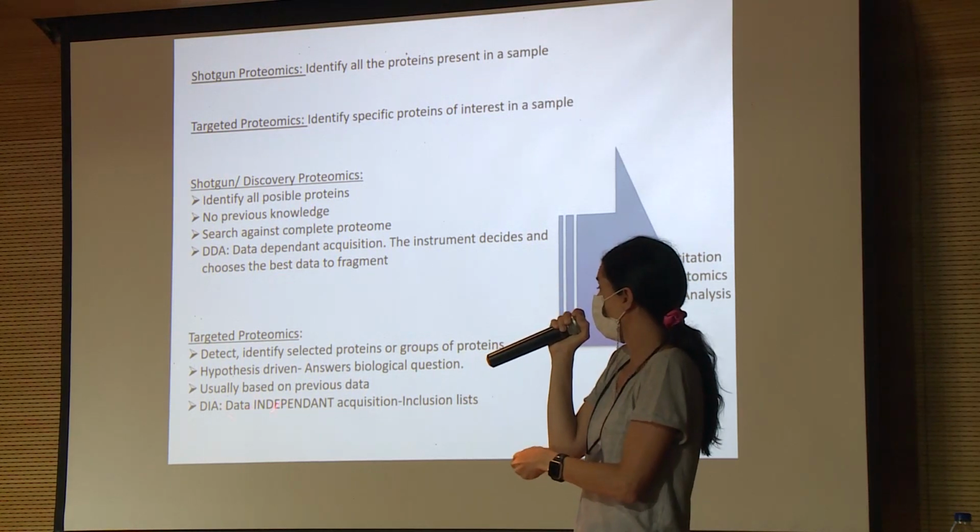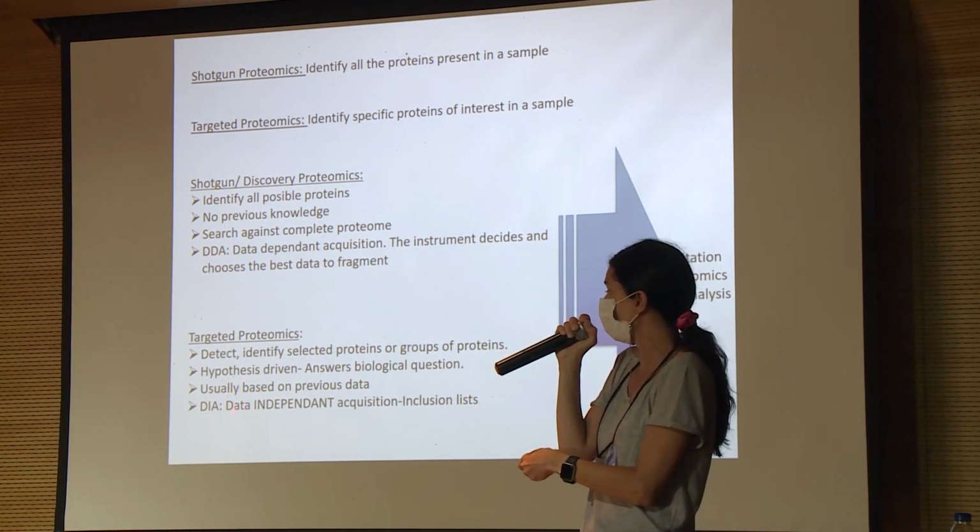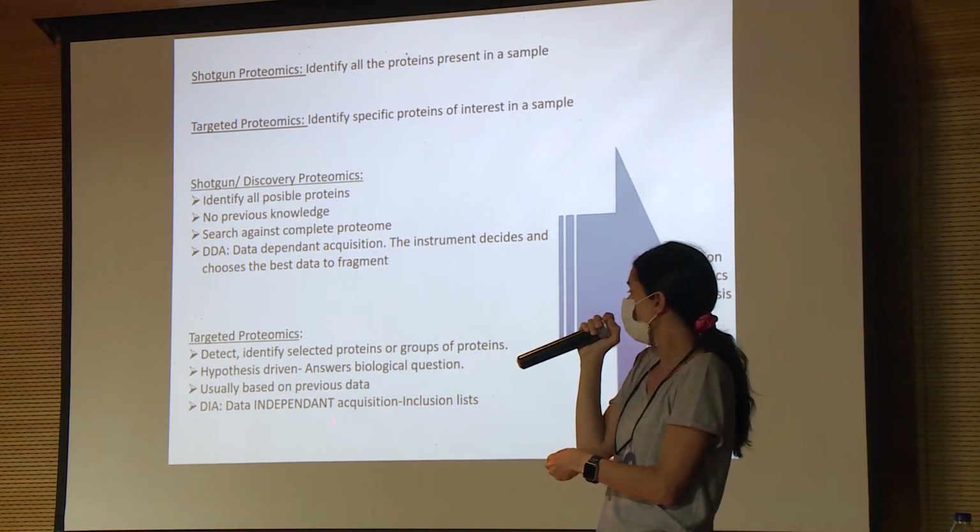In these approaches, we will be using what we call DIA, data independent.